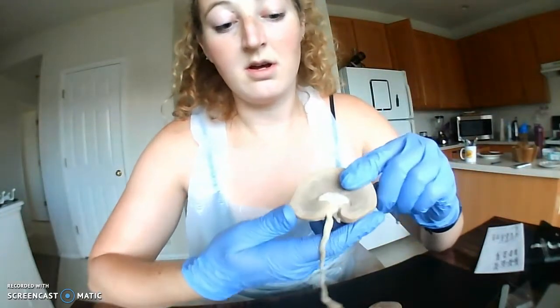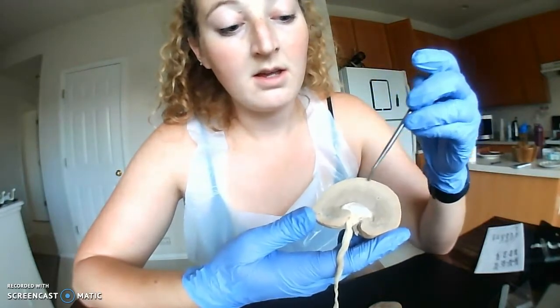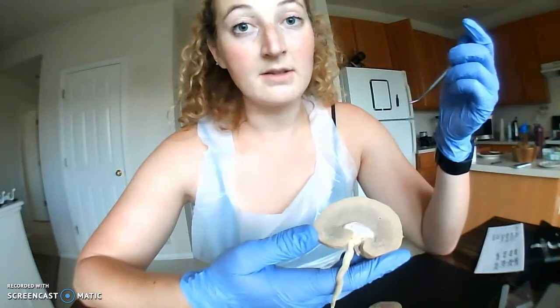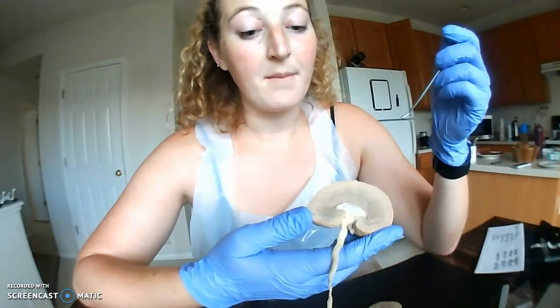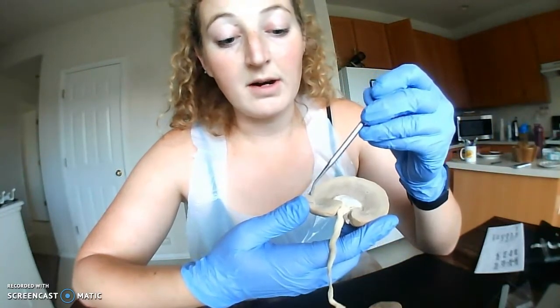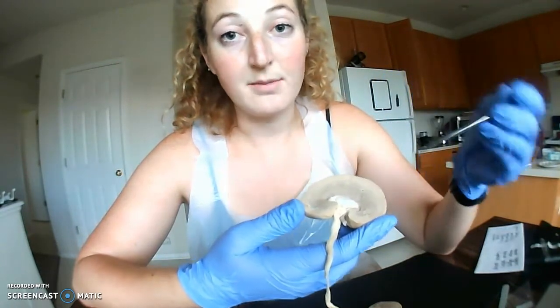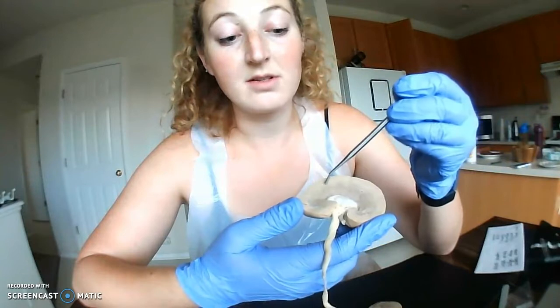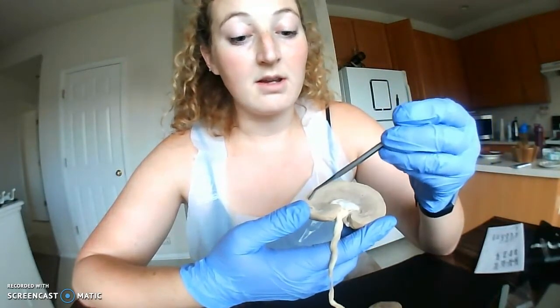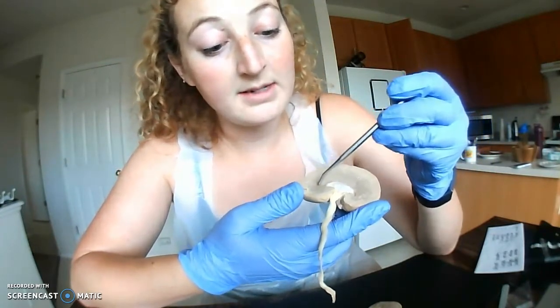So, the most superficial layer of the kidney, that's going to be this section right here. That is the renal cortex. So looking at it from the point of nephrons, this is going to be where all those capillaries bundle up to make it into the Bowman's capsules. This is kind of the starting point for all the filtration. So the blood starts out in this cortex, makes its way deeper into the kidney.